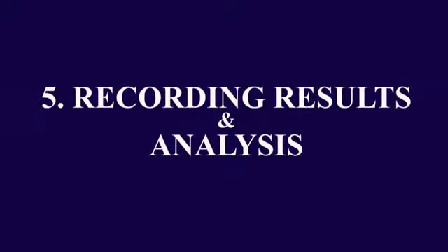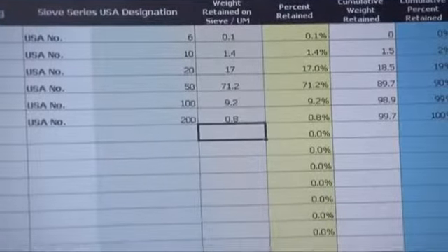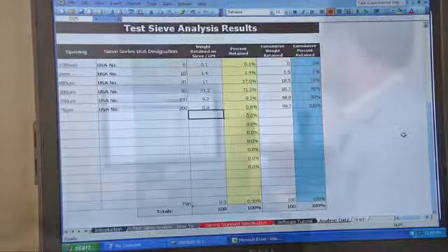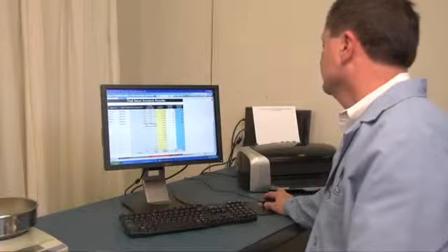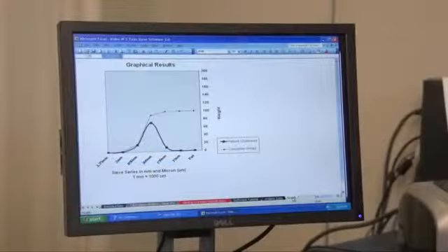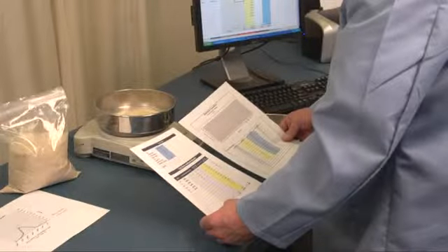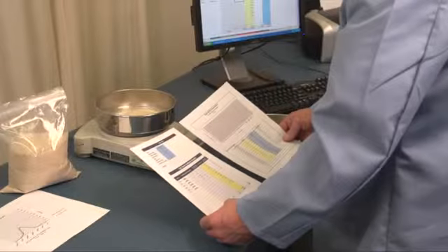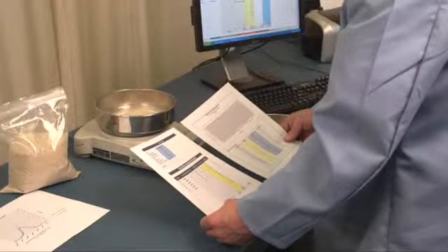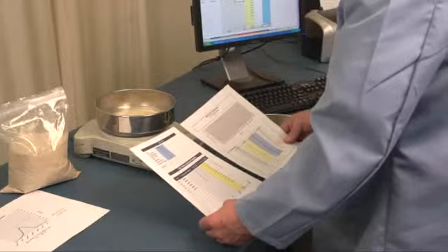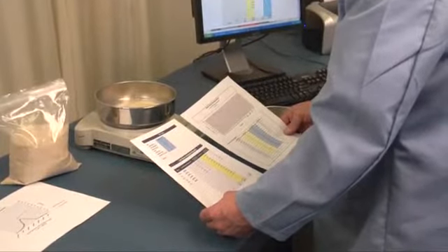Recording Results and Analysis. The final step in the quality control process is the analysis. The W.S. Tyler sieving software will total the recorded weights, calculate cumulative weight retained, and a cumulative percentage retained or passing for each test sieve. In the absence of a software program, the same data must be recorded and then calculated. The software will configure a particle size distribution curve for the records. To begin your analysis, compare the product specification requirements to your results. The recorded data, highlighted in yellow, should be compared to corresponding requirements of the product specification sheet, highlighted in blue, to determine whether or not the size distribution of the sample material is acceptable.